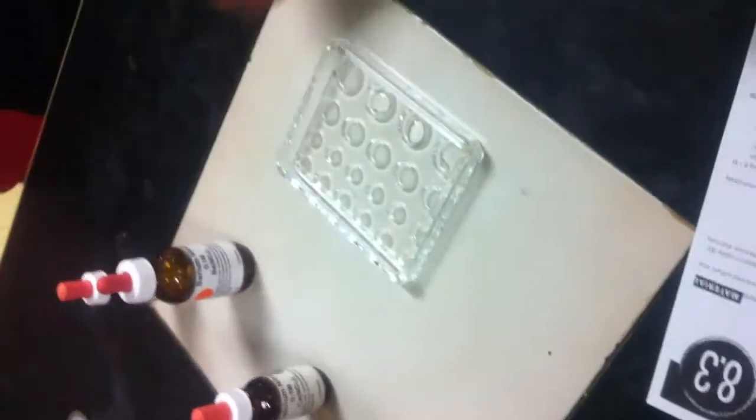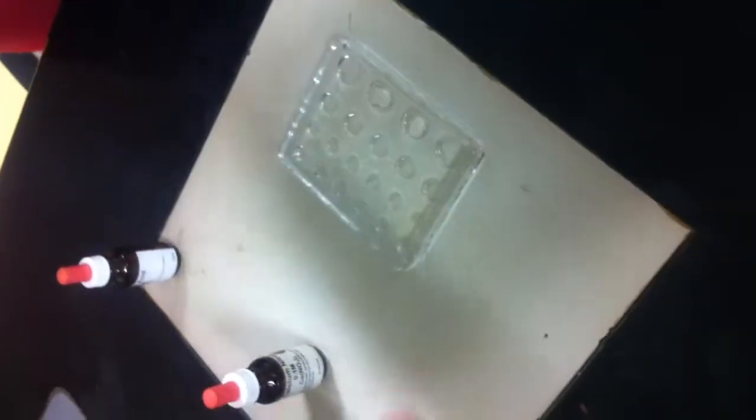Next, add three drops of barium nitrate to the first well. It's going white. There is a white precipitate.